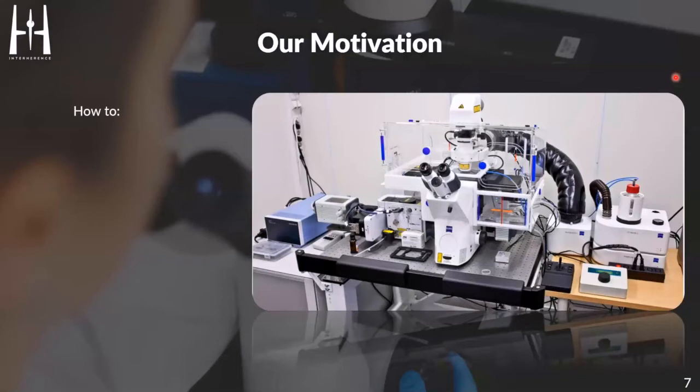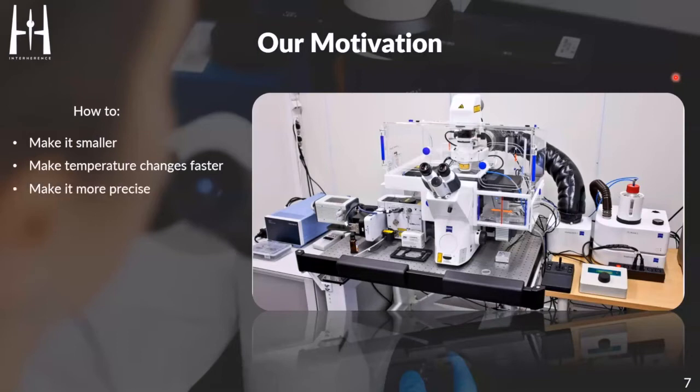So we wanted to make these devices much smaller. We wanted to make temperature changes much faster. We wanted to make it more precise than this type of arrangement, because in these arrangements, you might have a temperature sensor which is far away from the sample, and this might lead to not very accurate temperature measurements in your sample.